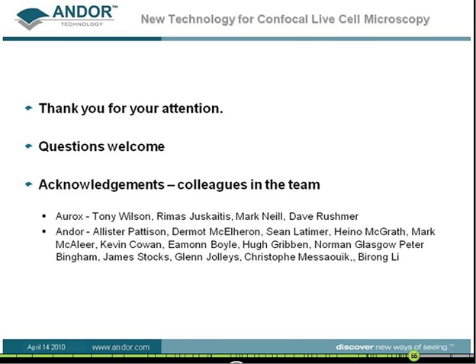Compared to what? Okay. When you say twice as much light, I think he's implying because it's a 50% transmission. Well, it's 50% transmission, but remember when we combine the signals, we get the benefit of twice confocal over the wide field. So it's a very difficult question to answer. I think we would need to dig into what we're comparing it to. But in order to get the same amount of wide field light, I think the wide field is going to be equivalent to the signal you would be applying in a wide field context.